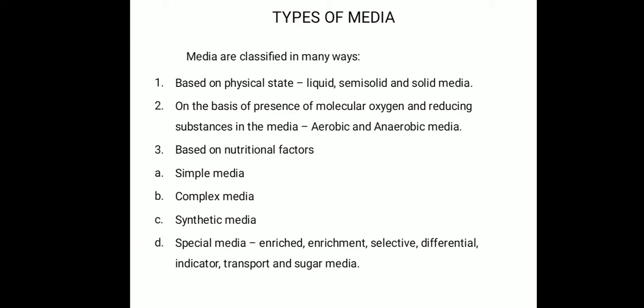Then based on nutritional factors, we have simple, complex and synthetic media. We also have special media like enrichment, selective, differential, indicator, transport and sugar media. These all come under special media.